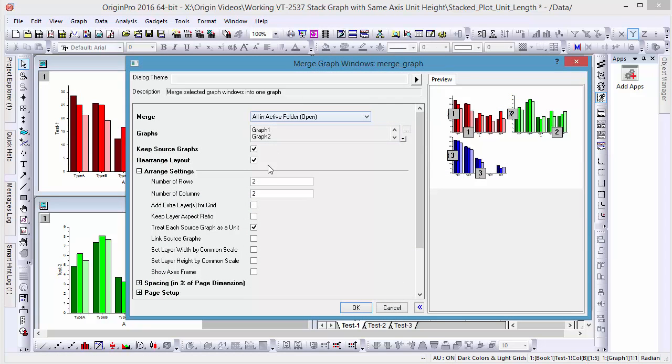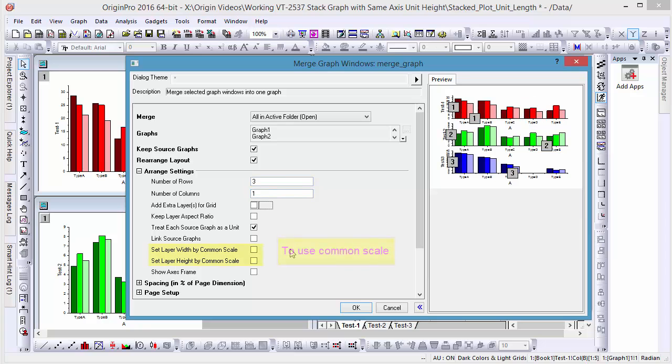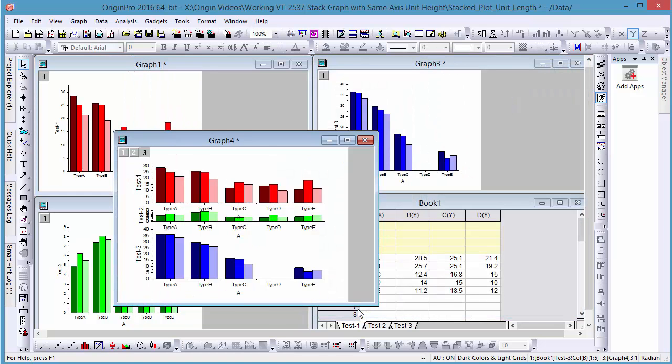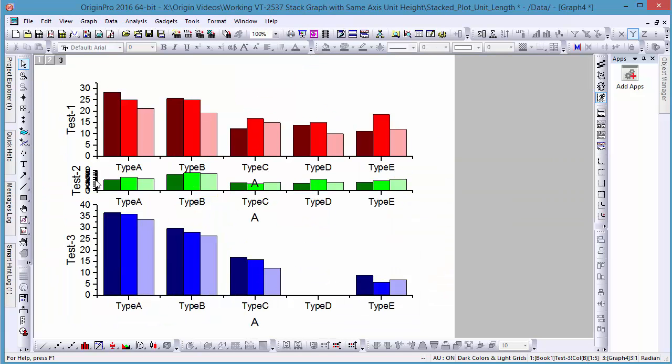To stack the three plots, under the Arrange settings, let's change the number of rows to three and the number of columns to one. Then, to use a common scale, let's check Set Layer Height by Common Scale. Here we see our merged graph with the same axis unit lengths.